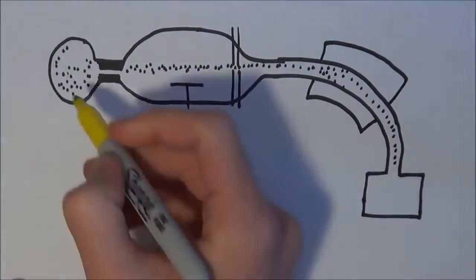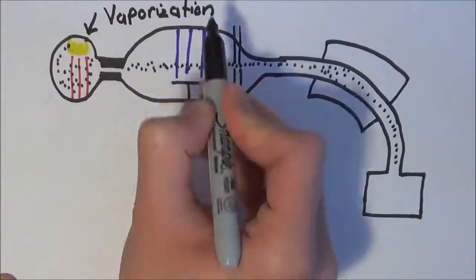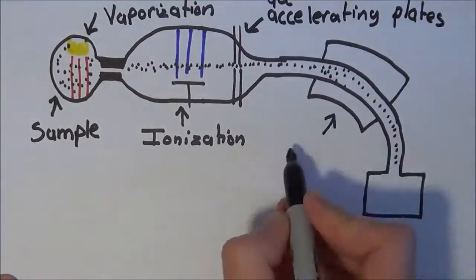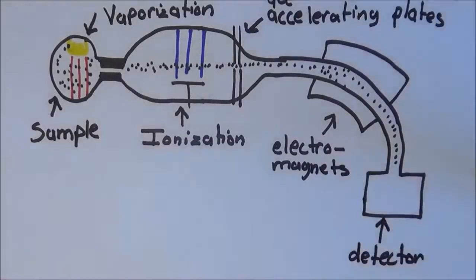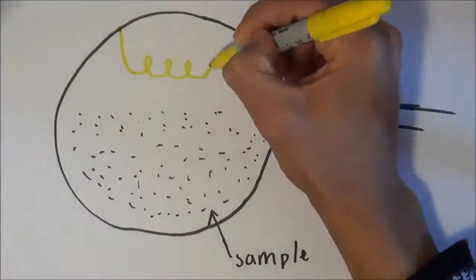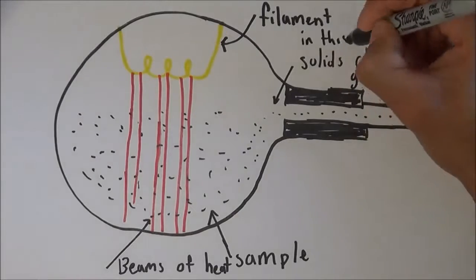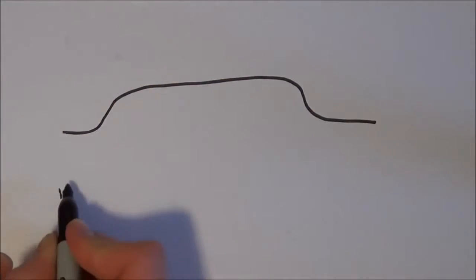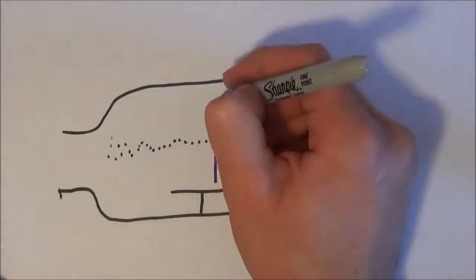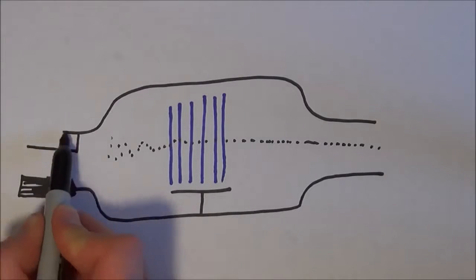Mass spectrometry is a field of science that uses technology with a fairly simple concept. An accelerated mass spectrometer is a measuring device that is incredibly precise. First, the sample is passed through a beam of heat to vaporize a substance, changing it into a gaseous state. This makes the substance easier to work with. Second comes ionization, which consists of giving an element or the molecule a positive charge. Since you can't give protons, we remove the electrons instead by shooting electrons at the sample molecules.